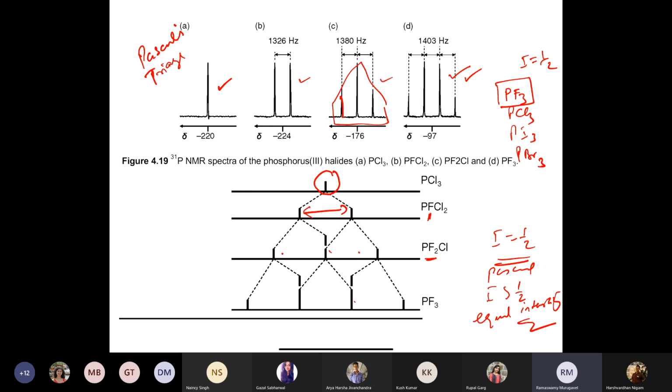Okay, 1:2:1. But the best example is CDCl3. How many of you have seen the spectrum of CDCl3? Okay, you have seen this, right? The carbon NMR spectrum. 13C is I equal to 1/2. Deuterium is 2H, I equal to 1. Okay, so the formula 2nI plus 1 will give you 3 lines. These 3 lines will have equal intensity, 1:1:1. I think only remember this.